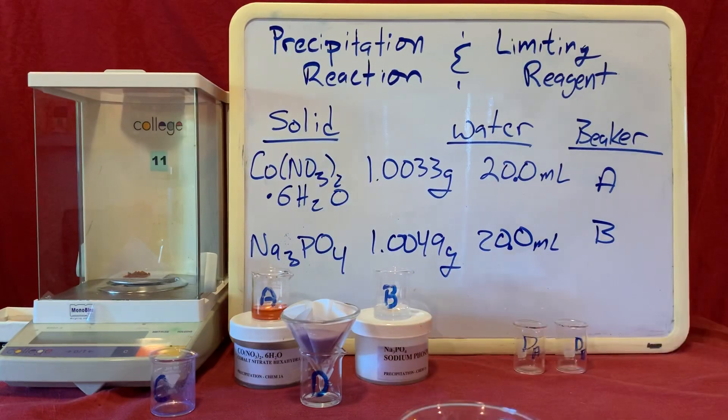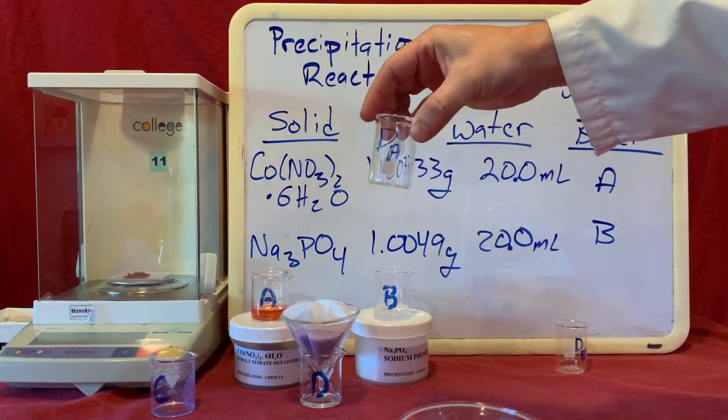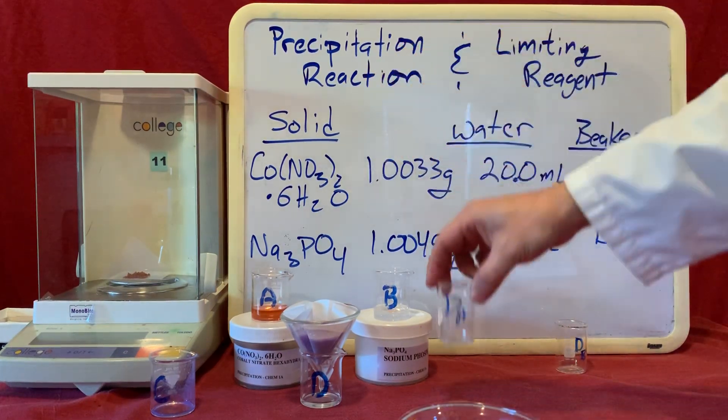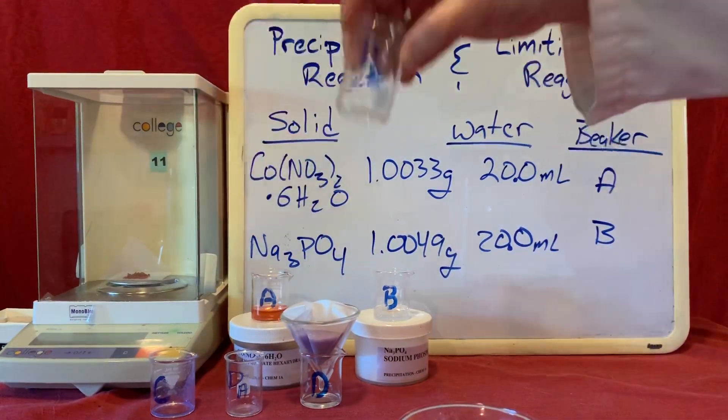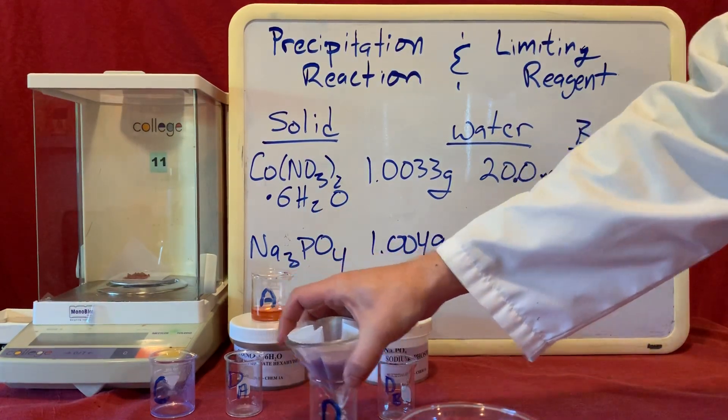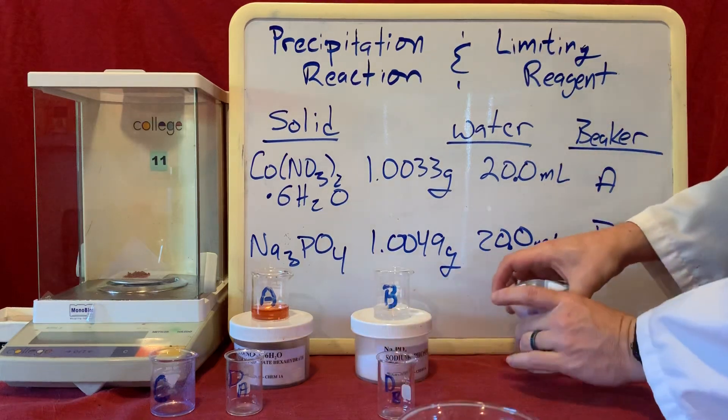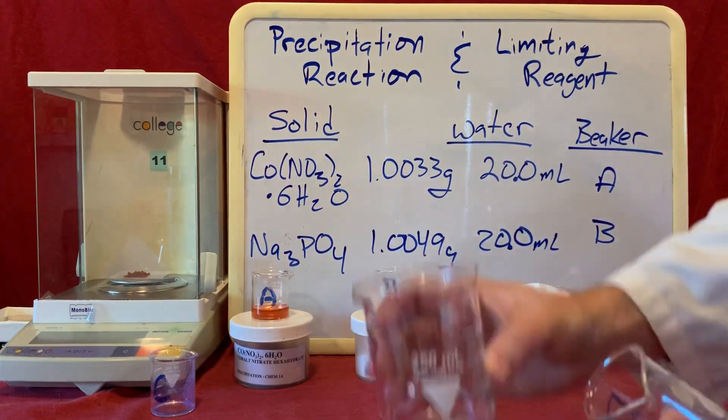Now what I want to do is I want to take this supernatant and I want to separate it into two different containers so that I can test it in order to figure out what's in it. I'm going to break this up into two different beakers which I've labeled D sub A and D sub B. I just want to mix them up and split up about 50-50.